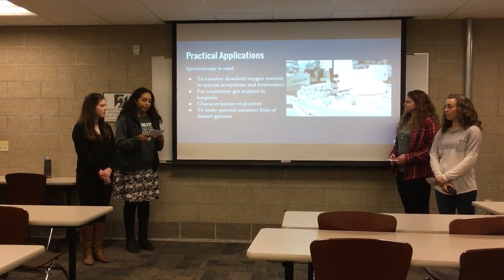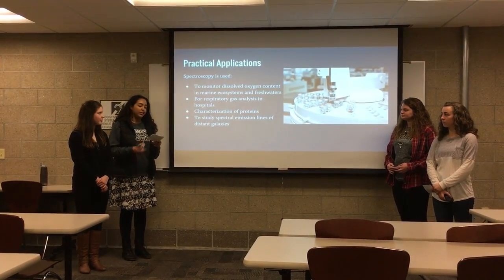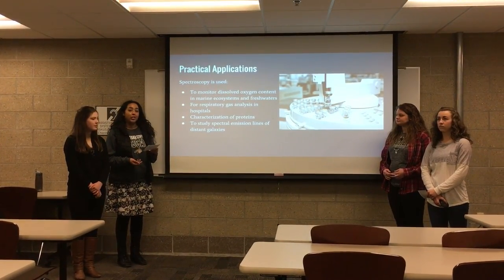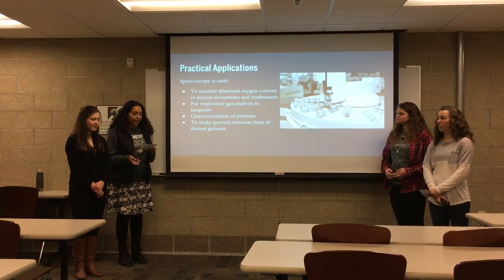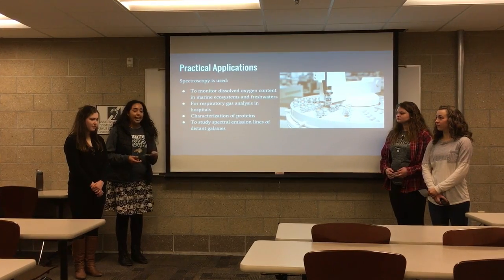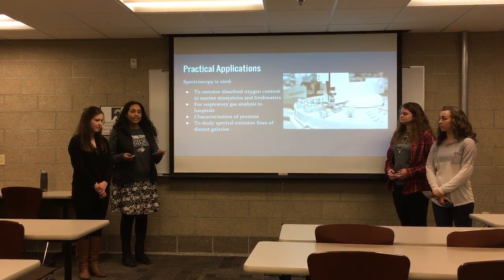So spectroscopy is used pretty frequently in the real world. Some examples are to characterize proteins, to monitor dissolved oxygen content in marine ecosystems and in freshwaters. It's also used for respiratory gas analysis in hospitals, and it's used to study spectral emission lines of distant galaxies.